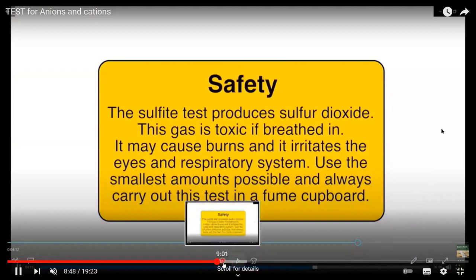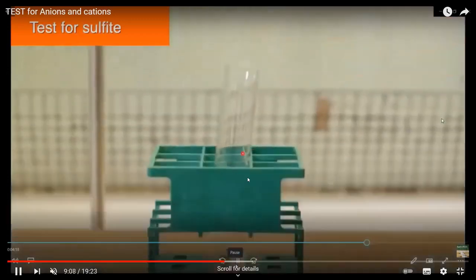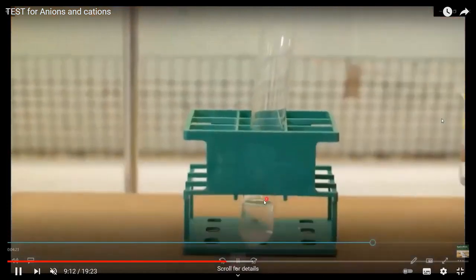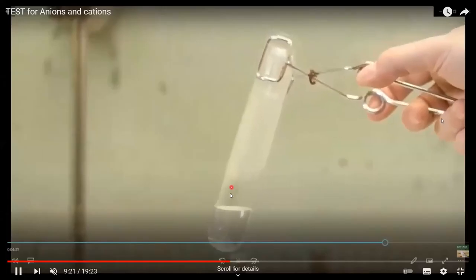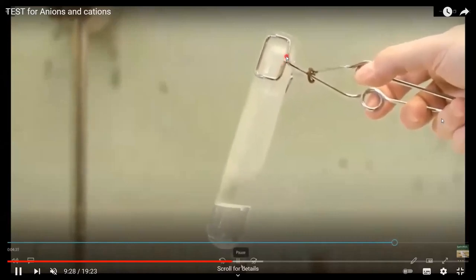So if you want to identify a sulfite ion, first we should make a solution. So we have a sulfite salt solution. Sulfite means SO3. We add hydrochloric acid and then we will heat it. For the test for the sulfite ion, we add hydrochloric acid to a sulfite, and sulfur dioxide is a toxic gas, so it should be done in a properly ventilated room or a fume cupboard as a safety precaution.